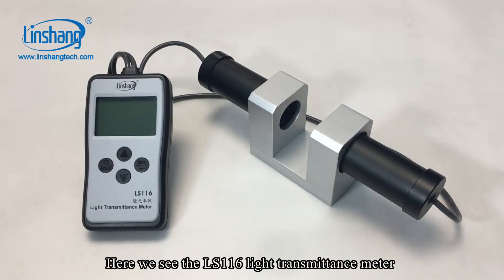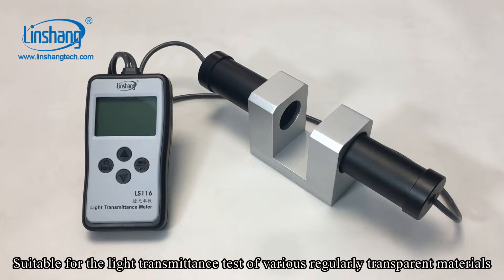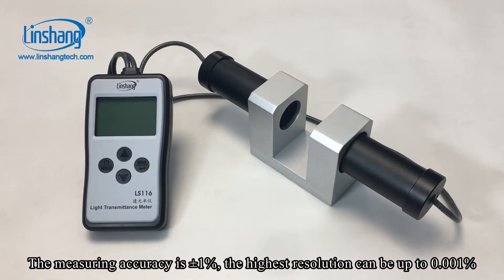Here we see the LS116 light transmittance meter. The meter is designed with a parallel light path, suitable for the light transmittance test of regularly transparent materials. The measuring accuracy is plus or minus 1%.